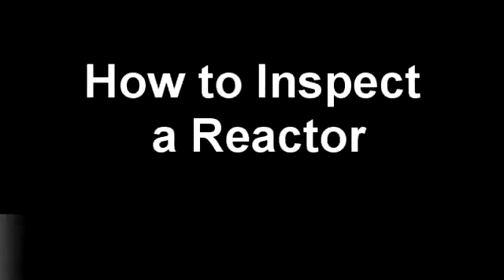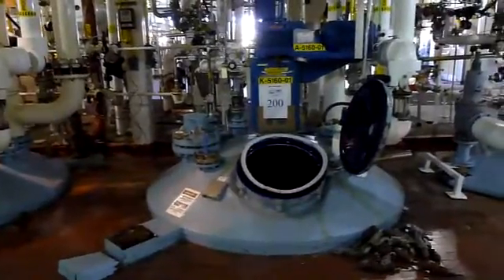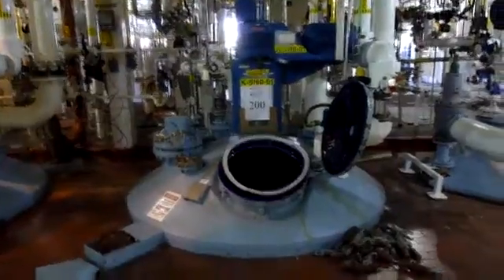How to inspect a glass-lined reactor. We at EquipNet highly encourage you to perform your due diligence and inspect any used reactor that you are considering purchasing.